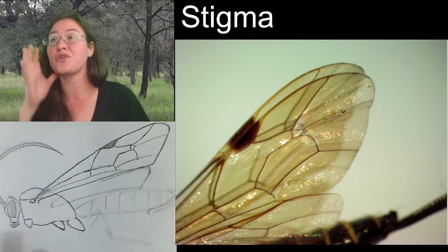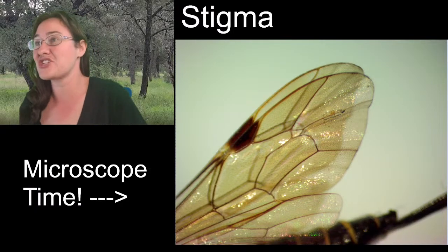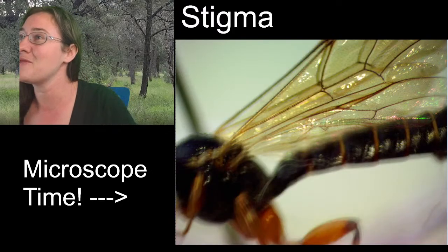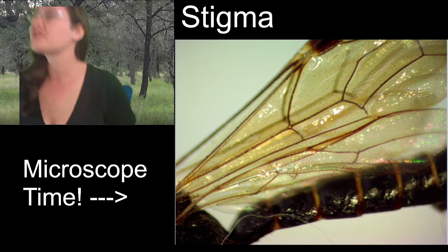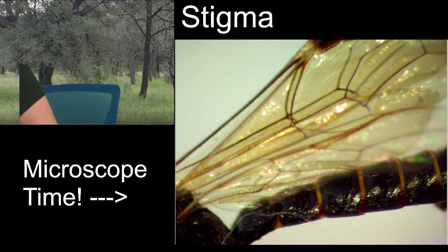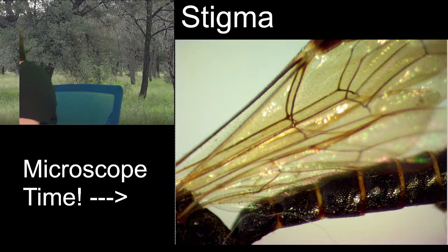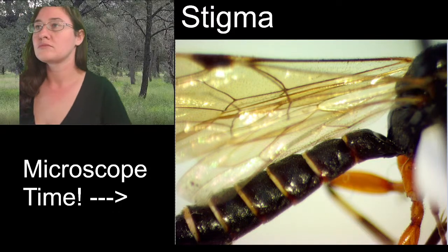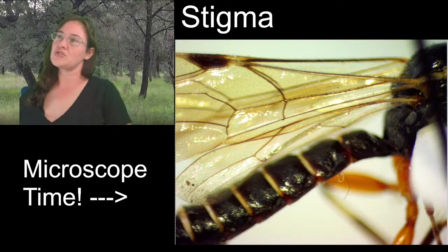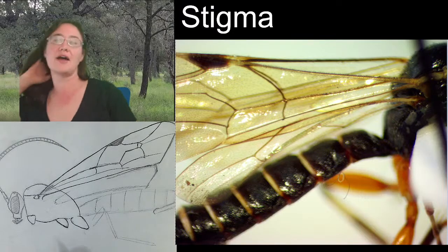So our front wing is really the one that we pay attention to for defining characteristics, but we are going to go ahead and sketch the wing veins on our hind wing too, because it'll make our sketch look nice. Although I'm not sure if we're going to be able to see them. Let me, yeah, that's going to be a little bit trickier. So I think that this is our best view that we're going to get of the hind wing, because the hind wing doesn't have a whole lot of veins on it.